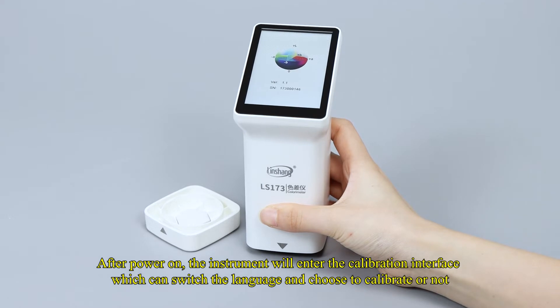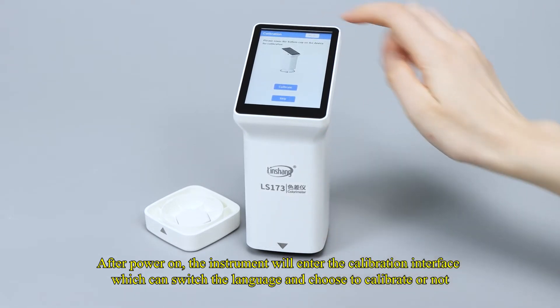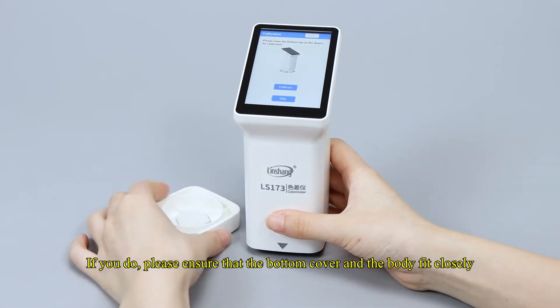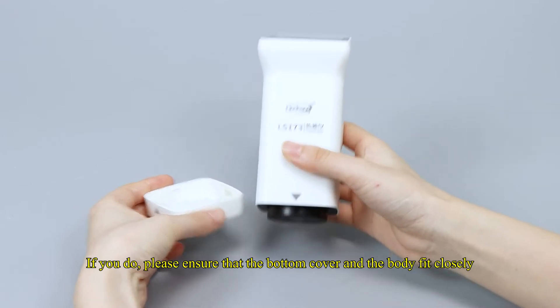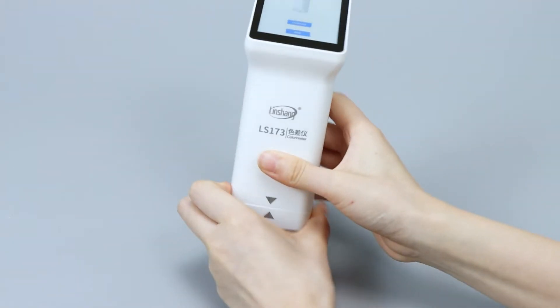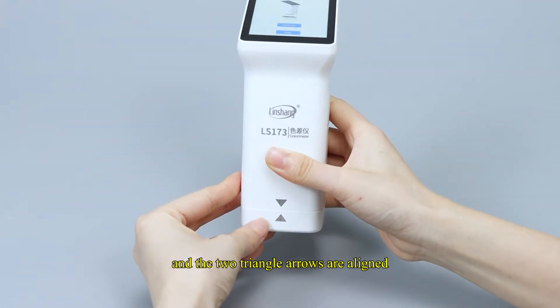After power on, the instrument will enter the calibration interface which can switch the language and choose to calibrate or not. If you do, please ensure that the bottom cover and the body fit closely and the two triangle arrows are aligned.